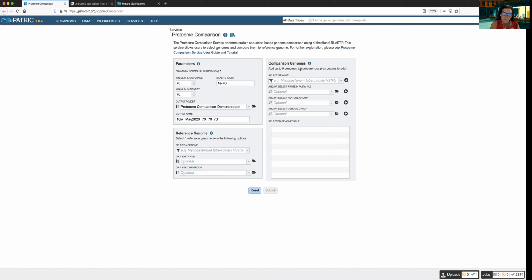In the very introductory video for the proteome comparison, we talked about this being a bidirectional BLAST tool that's established with the reference. It's only going to show you the bidirectional BLAST hits of genes that are contained in the reference. If the comparison genes have something unique, you aren't going to see it, and you'll need to submit those as a reference genome if you wanted to see that later on. But let's look at how we can choose different comparison genomes.